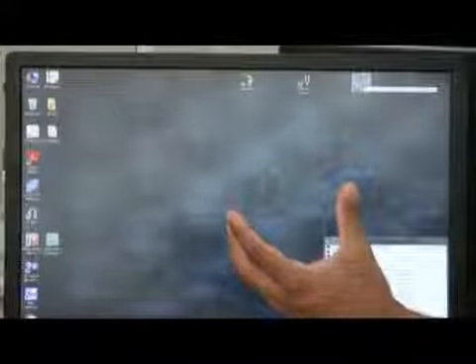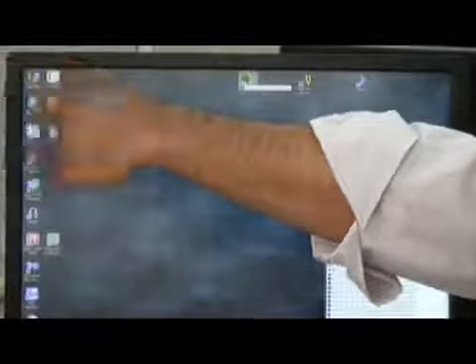And if you want to operate your LC directly, direct control of the LC, then you go here, Chromeleon. You can control the LC from Excalibur also, but through a proper method. If you want to control it directly, like purging, checking flow, syringe purging, and setting column temperature, you can do it from here.